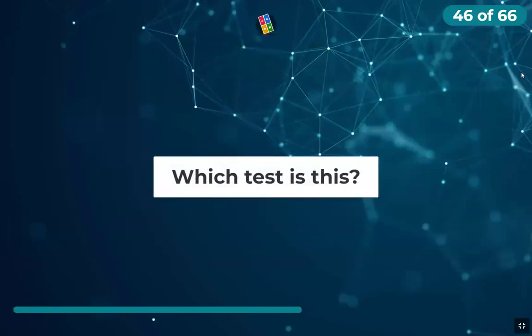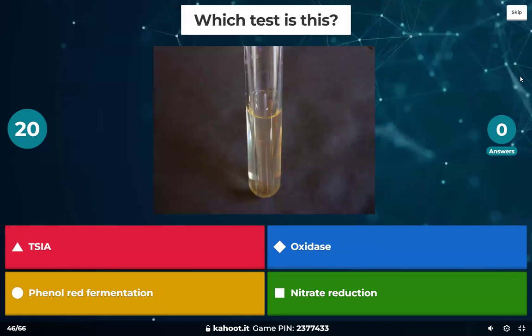All right, which test is this one? So notice that there is a Durham tube in there.